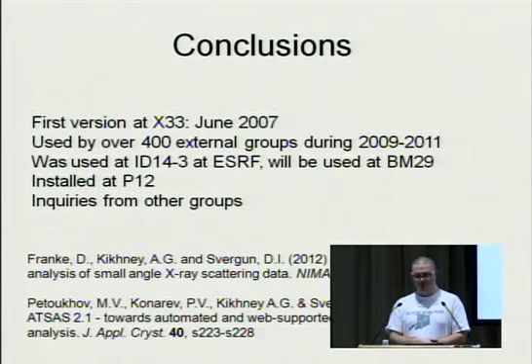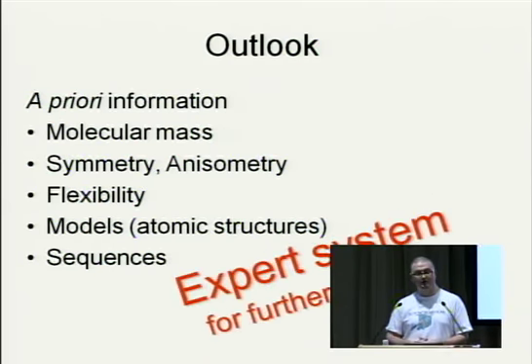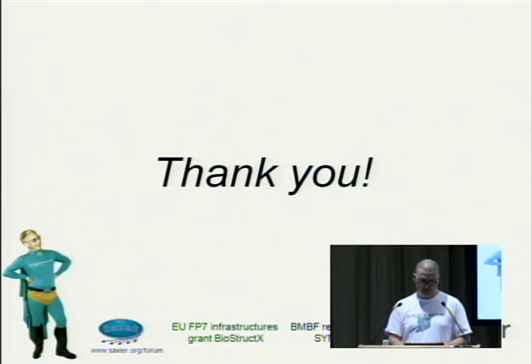I'm quite convinced that SAXS has a big, bright future, and it will become a routine method for screening of multiple samples. It's already a high-throughput technique that is available for the scientific community, and we are working on making it smarter and introducing more checks, more data validation, and making it more foolproof and more user-friendly. And I thank you very much for your attention, and I hope that you will enjoy SAXS in the future.